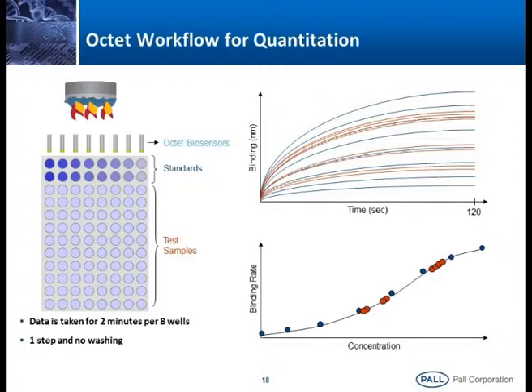How exactly does it work? For a quantitation purpose, 8 sensors, I am dipping here. You can see we generated different concentrations here, say from 100 microgram per ml, 2-fold dilution. With 8 concentrations we can determine, 8 samples read at a time. Think about if you are performing even a UV based one sample, how much time it will take for a reading. So roughly 8 concentrations or 6 data points, half an hour. Each time you have to wash the cuvette and then put the next concentration.